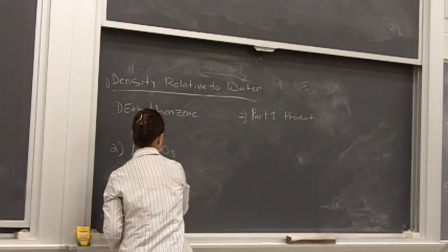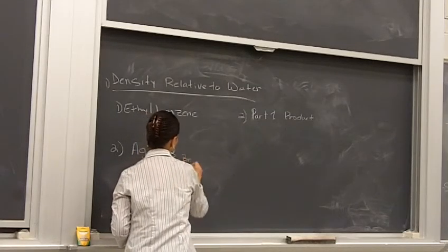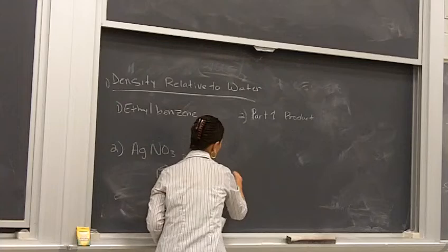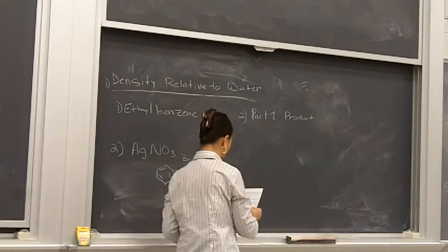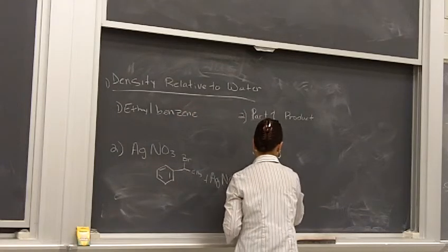So in this case, we're taking our product, which is halogenated. We're going to react it with silver nitrate. And this is all like the silver nitrate's in ethanol, and we're also going to use ethanol to get this soluble, so we don't have to worry about it crashing out of something that's aqueous, okay?